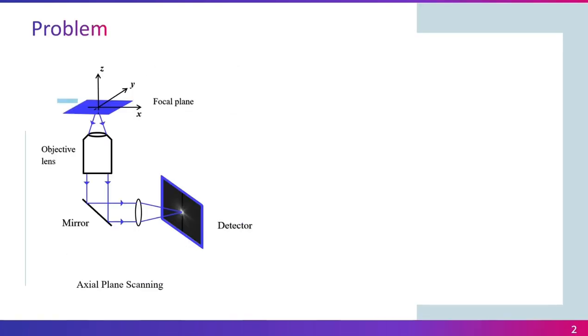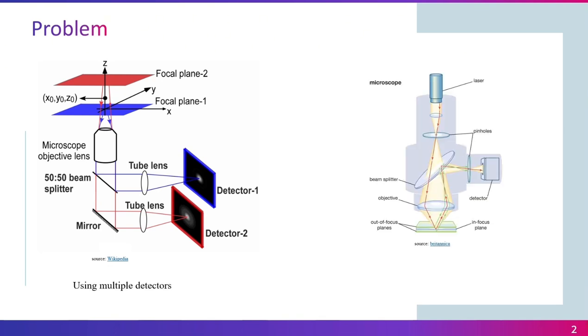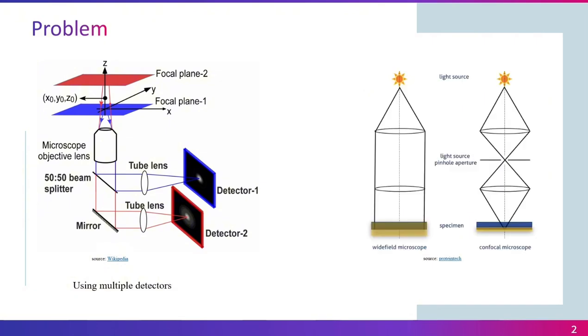3D microscopic imaging faces significant challenges that hinder its effectiveness. Axial scanning methods extend scan times, reducing temporal resolution and complicating specimen stabilization. Using multiple detectors can lower measurement quality and complicate hardware design, impacting data accuracy and analysis of dynamic processes.